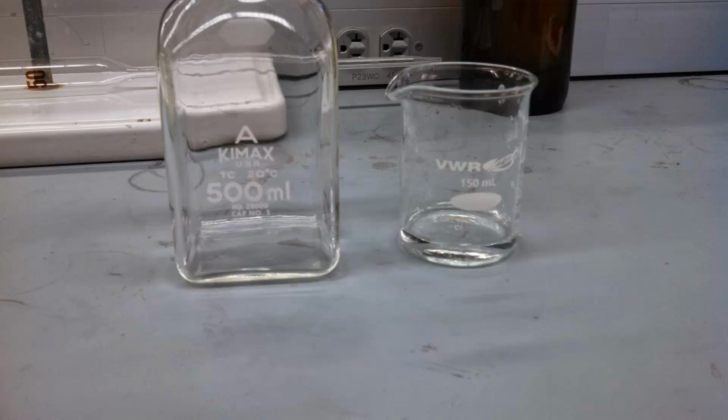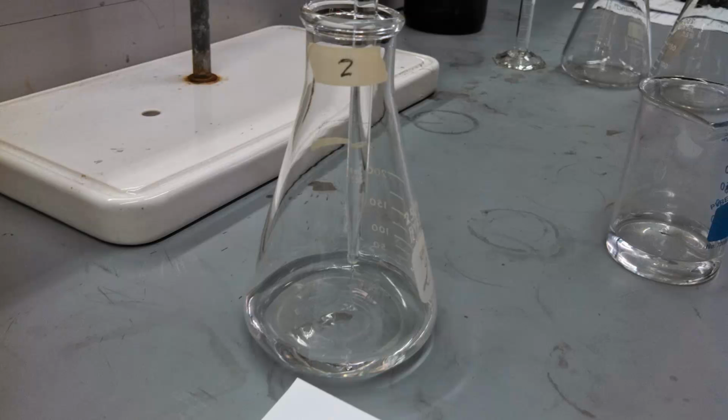You're going to make your potassium iodate solution. So this is KIO3. This will be in your weigh bottles from last week when you come in. You're going to weigh out the appropriate amount into a 150 ml beaker, dissolve it in a little bit of water, add this to a 500 milliliter volumetric flask, and then dilute to the mark. This is going to be your primary standard solution. You're going to pipette 50 milliliters of it into each of your titration flasks, both for the standardization and the unknown.